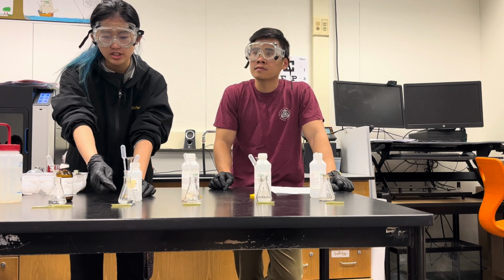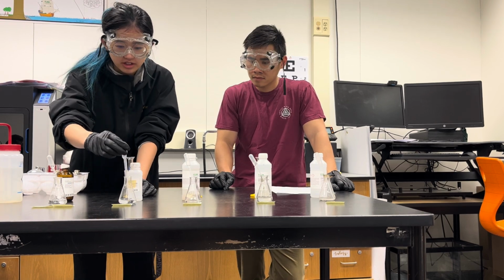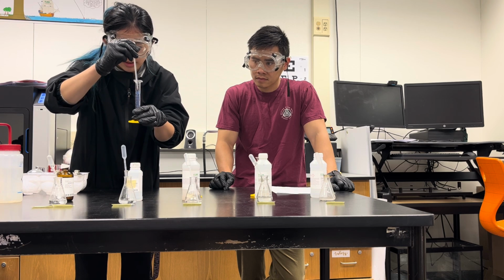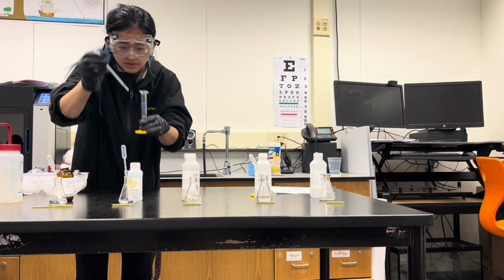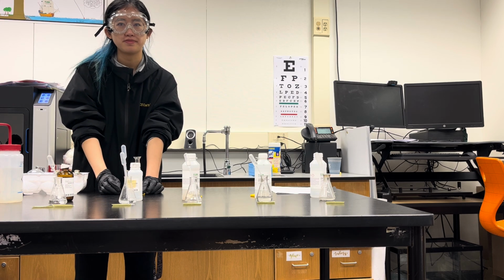So this has 2.5 milliliters of silver nitrate in it. Then I'm going to take 2.5 milliliters of ammonium nitrate and put it in the same one. So that means when it fills up, it should go to the 5 milliliter line, right? Because 2.5 plus 2.5 gives me 5. And then you have an extra pipette to mix it.